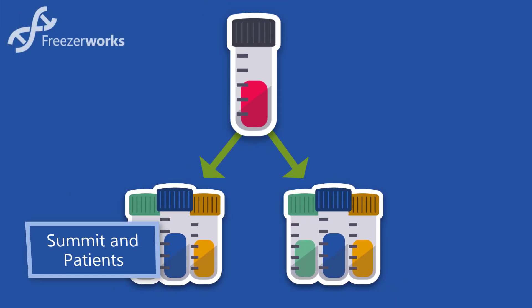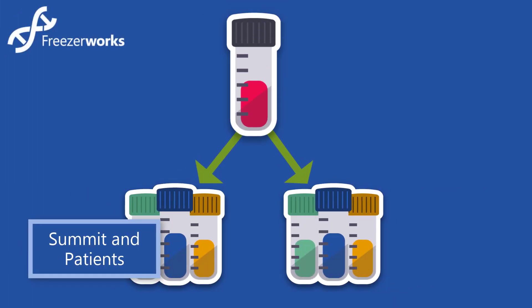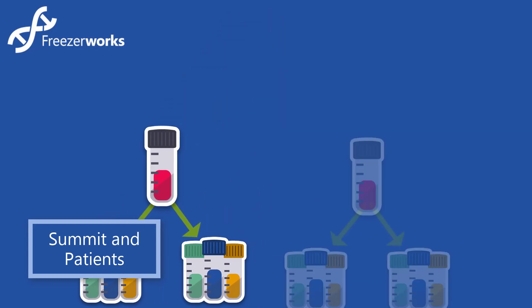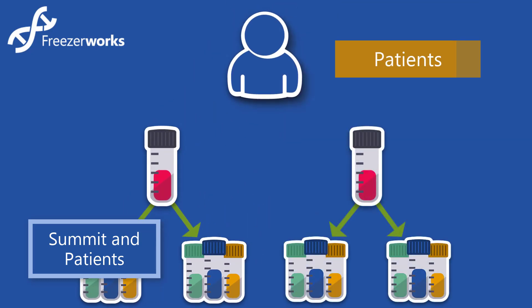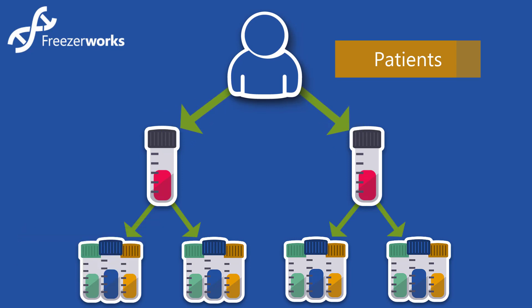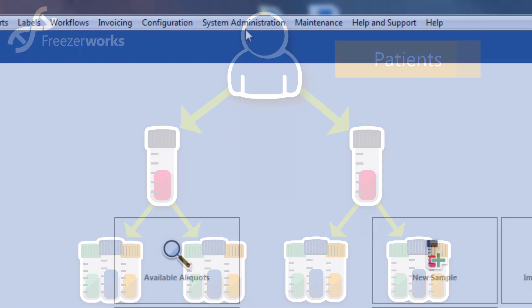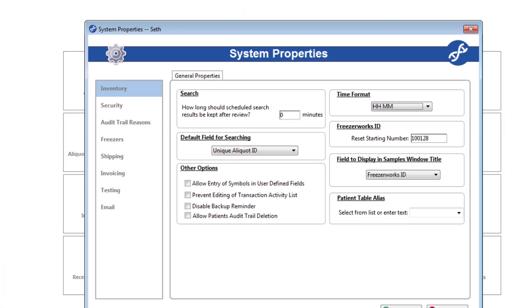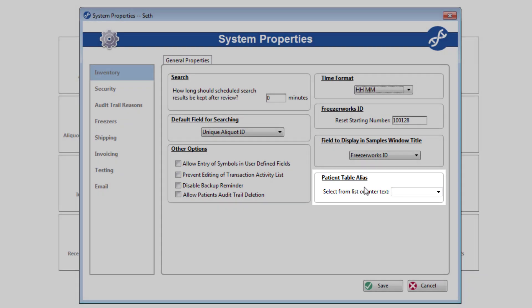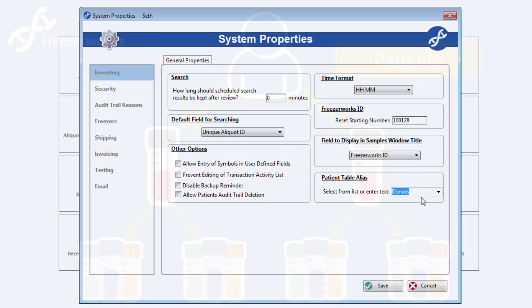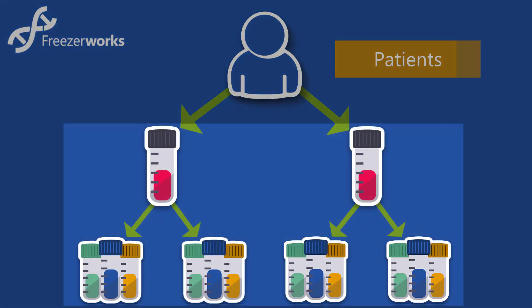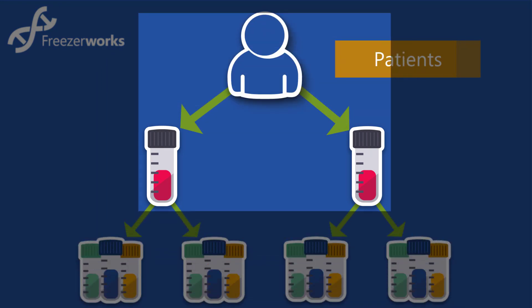Now, if you are using the Summit edition, an extra top layer is added to our relational hierarchy — the patients, or participants. Think of this layer as the source or origin of the samples in your database, metadata for the metadata. It's possible that you have an entirely different name for the patient level in your organization. If so, use the system properties option patient table alias to name it whatever you'd like. Just like aliquots are children to samples, so are samples children to patients.